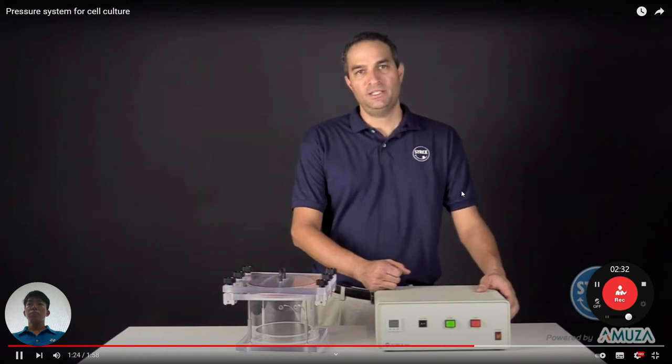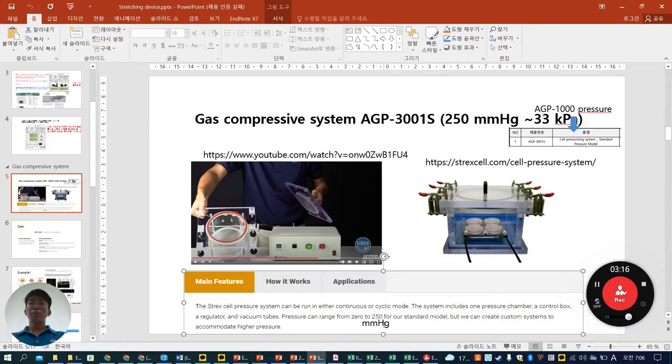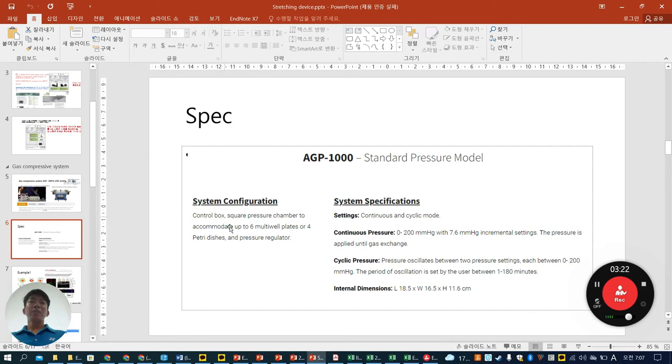Okay, so they mentioned that they can make up to 250 millimeters of mercury pressure, which is 33 kilopascal. And the spec is like that. They can put 6 multi-well plates or 4 petri dishes, as a single plane.